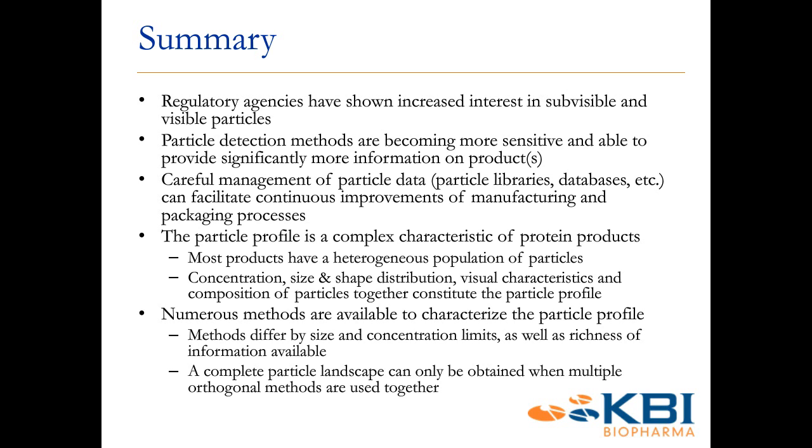Overall, we've seen that regulatory agencies have really shown an increased interest in subvisible and visible particles, and wanting industry to characterize those a little more, and certainly asking for things like identity when required. And we want to really emphasize that particle detection methods are certainly becoming more sensitive, so they're able to provide significantly more information. But careful management of this data is really important, and careful interpretation as well.